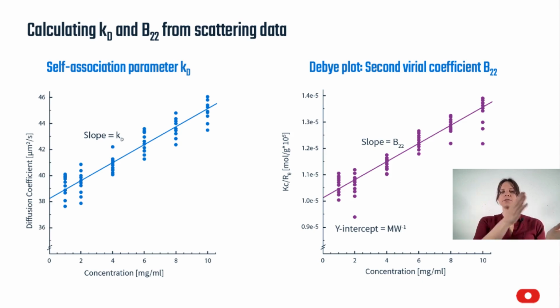A light scattering measurement is conducted on each individual sample, and depending on which type of light scattering you're talking about, a graph is produced that is concentration versus a dependent variable that correlates with each technique. Whether the slope of the resulting fit line is positive or negative, and how positive or negative it is, indicates the tendency towards self-association.